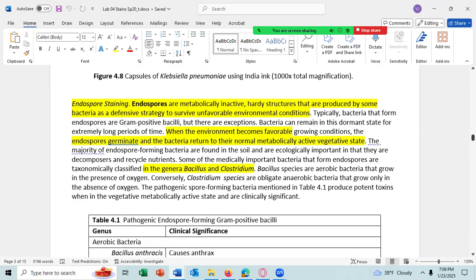Capsules, as I stated in the lecture, you will not be tested on it really in the lab other than perhaps this lab. And you do need to know about it because your unknown project may have you choose to do the capsule stain to look and see if the cells have capsules. Any question about any of that?